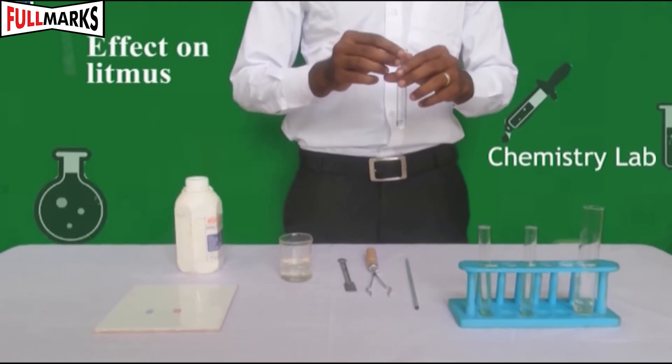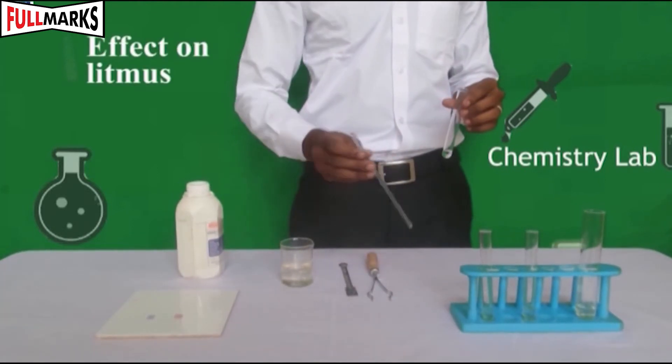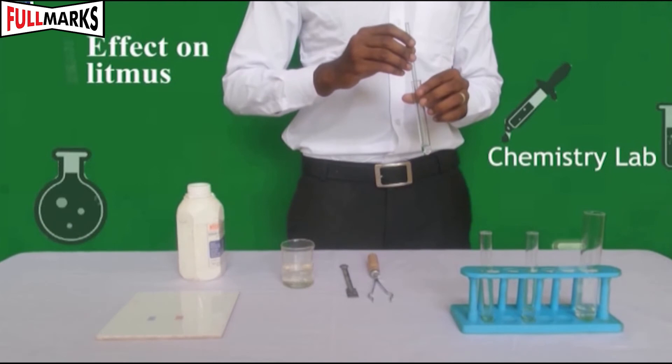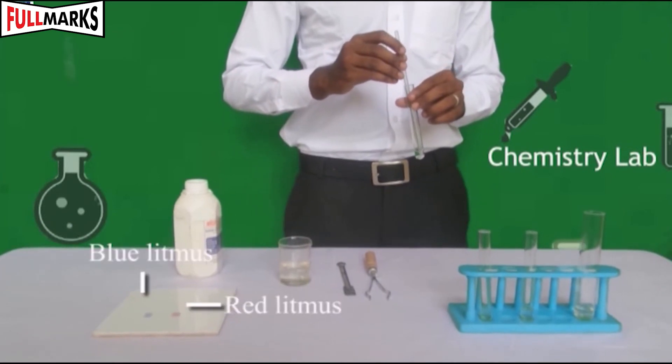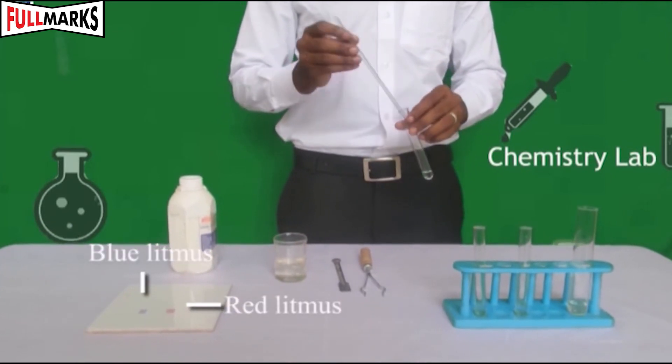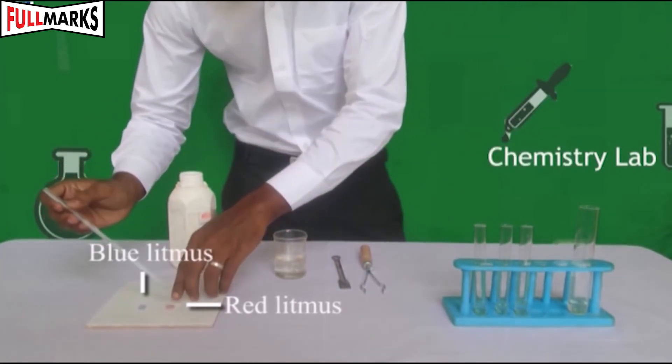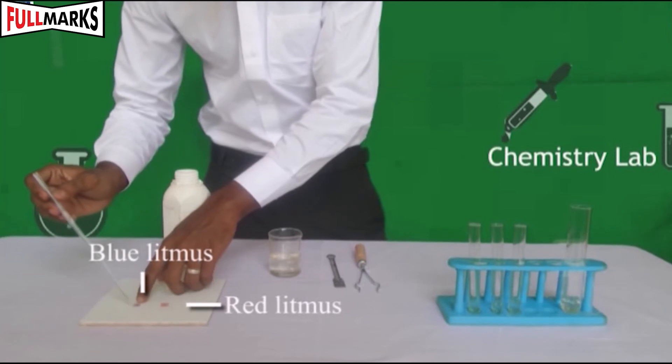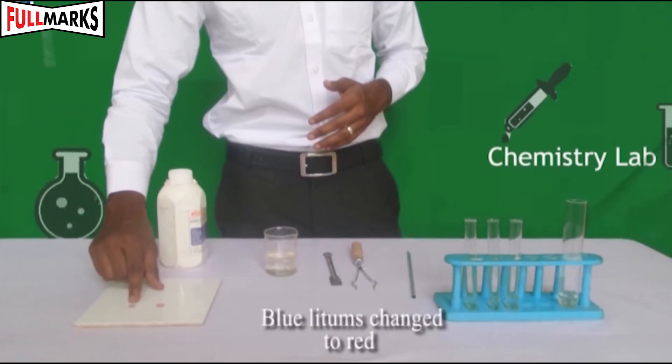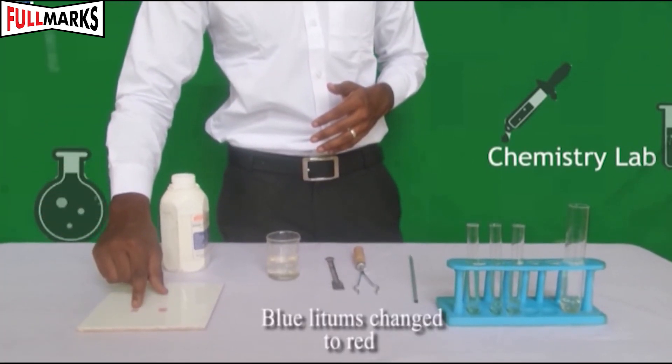Test 3: Effect on litmus. Use clean dropper and pour 1-2 drops of acetic acid on blue litmus paper. Blue litmus paper turns red.